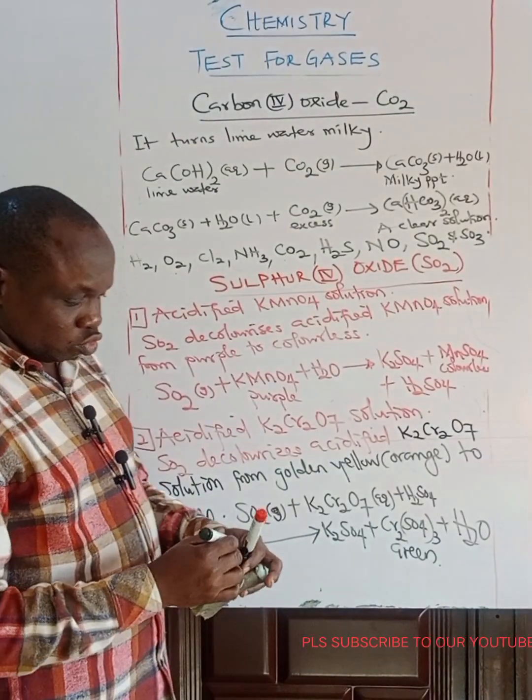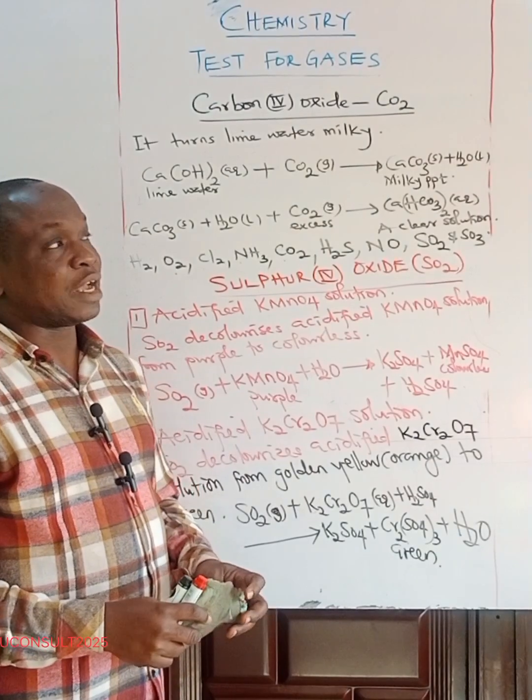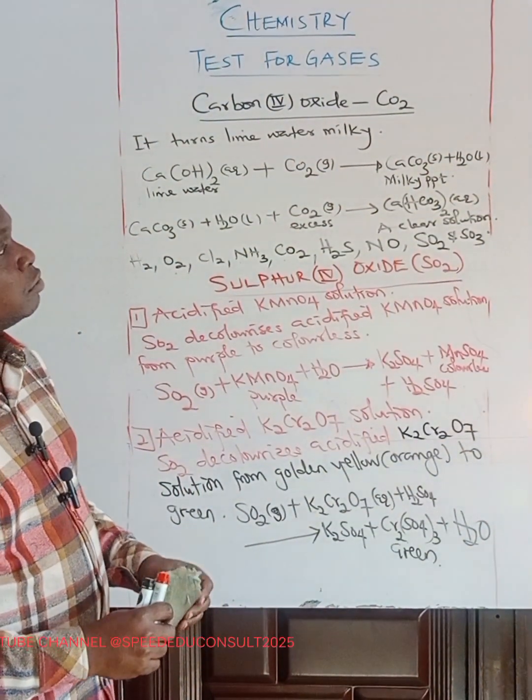So we've been able to discuss the gases that are very common in chemistry. How do we test for each of them?